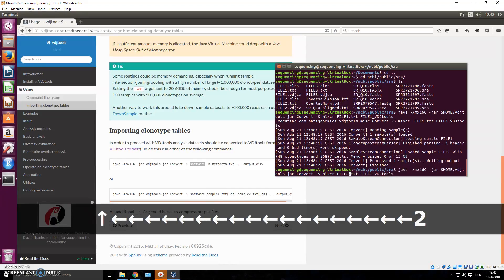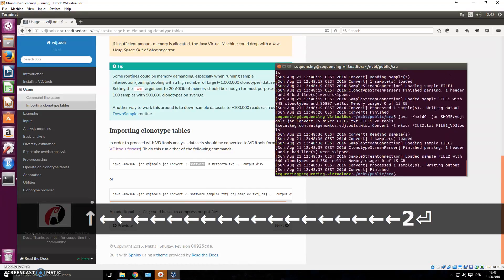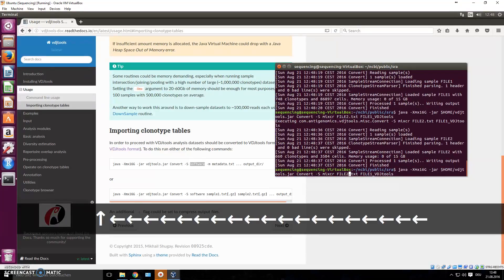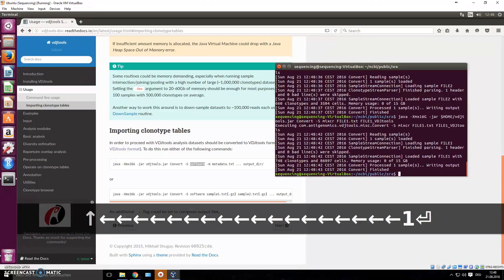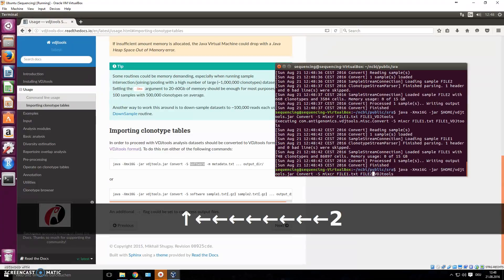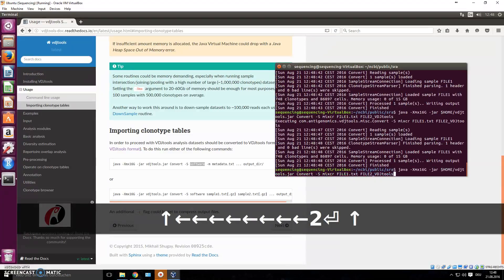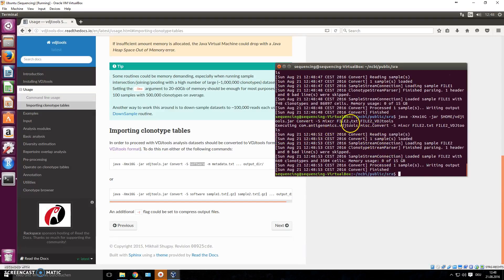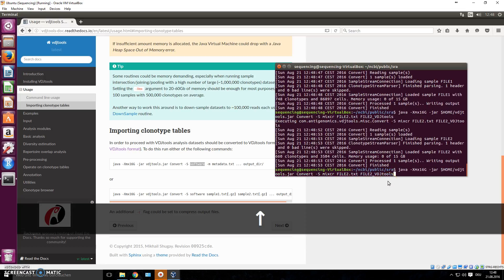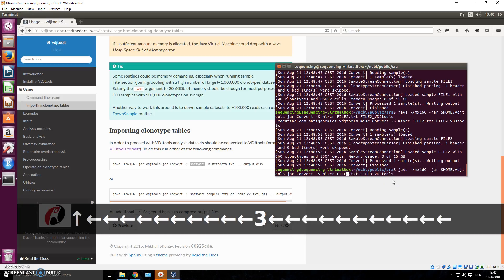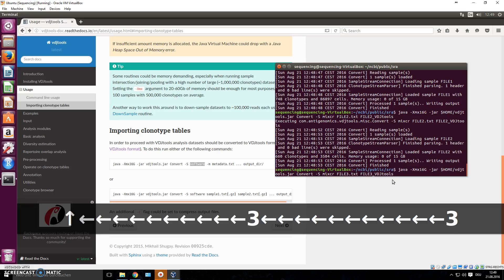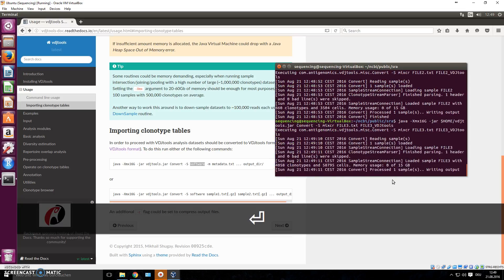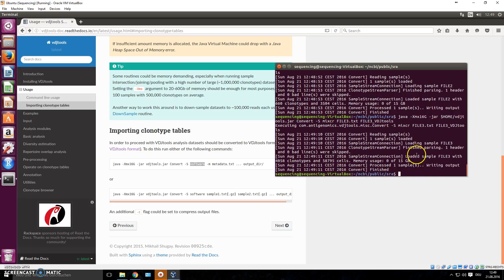I made a mistake and named the output the same thing, so it overwrote file1. Let me redo file1 correctly, then file2. I made another mistake again, but on the third attempt we rename the output to 'file3_vdj_tools' with the input being file3.txt. Press enter and now we have all three converted files.